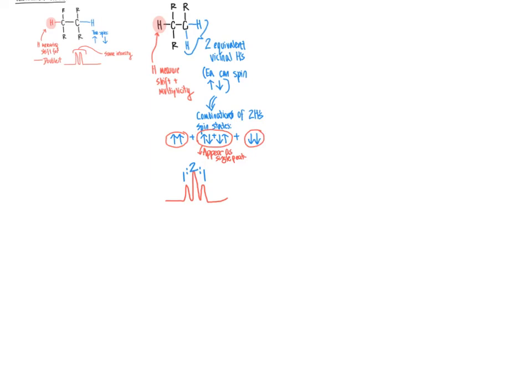So the relative areas of the multiplicity patterns is going to follow so-called Pascal's triangle.